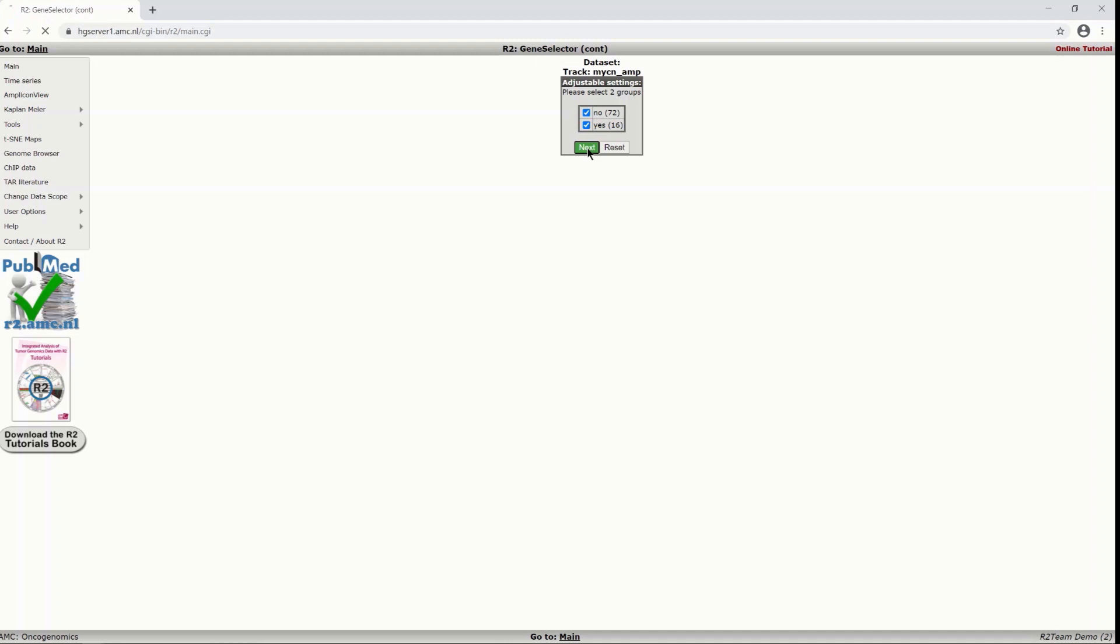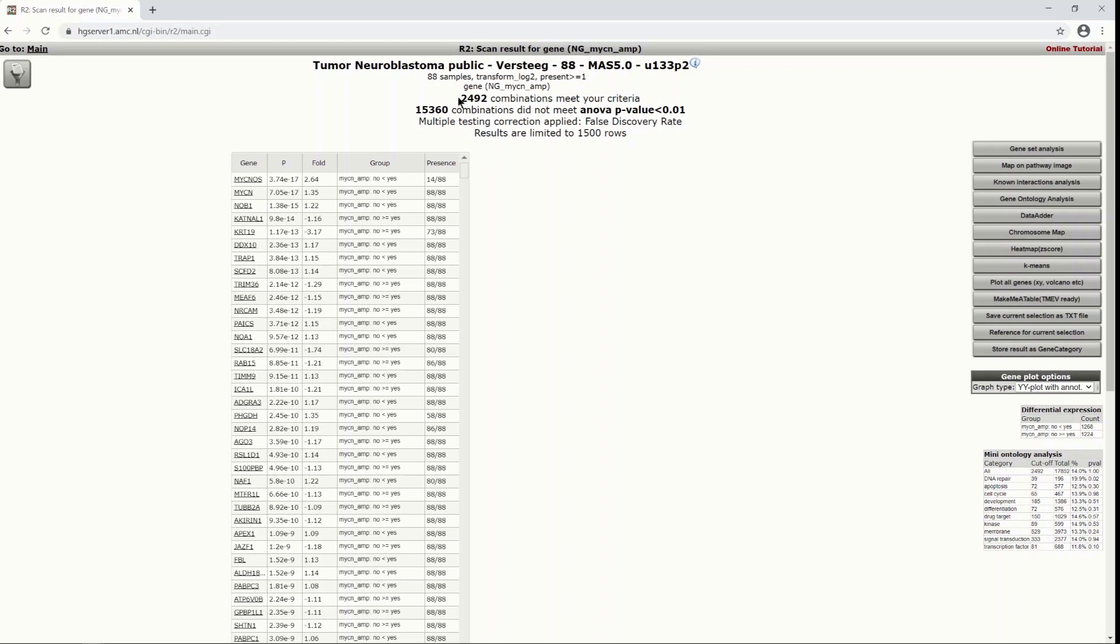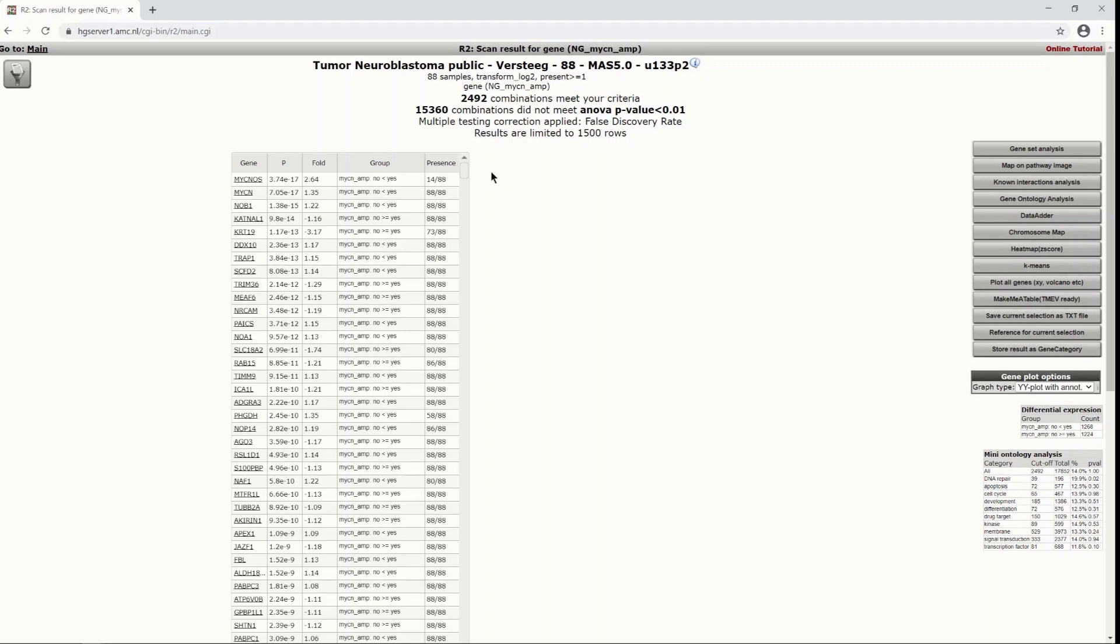And here we see that 2492 combinations met our criteria. Also we can see that multiple testing correction was applied and the results are limited to 1500 rows. You can see here a scroll option so you can just look through the list of genes and you can see that they are ordered by the p-value. If you just have a look at some of the top differentially expressed genes, let's take this one.